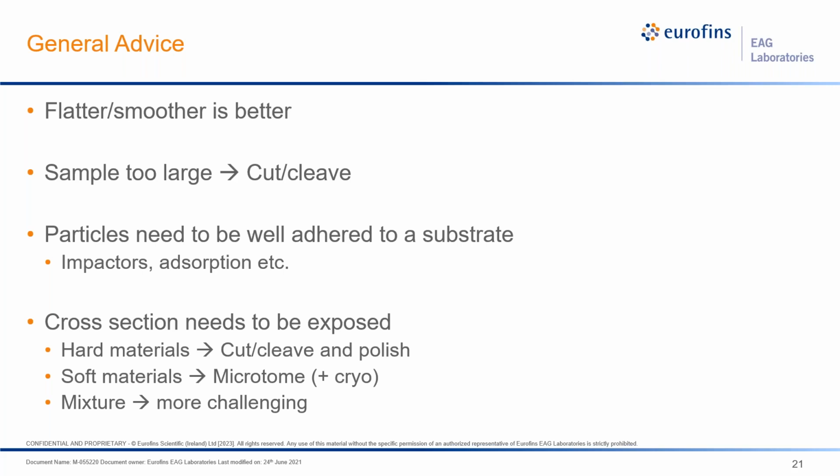If you have something like a loose particle, say aerosols or bacteria or anything of that sort, you have to adhere them relatively well to the substrate so they don't move while you're imaging and analyzing them. And this could be done through impactors or solvent adsorption, or numerous other types of methods.